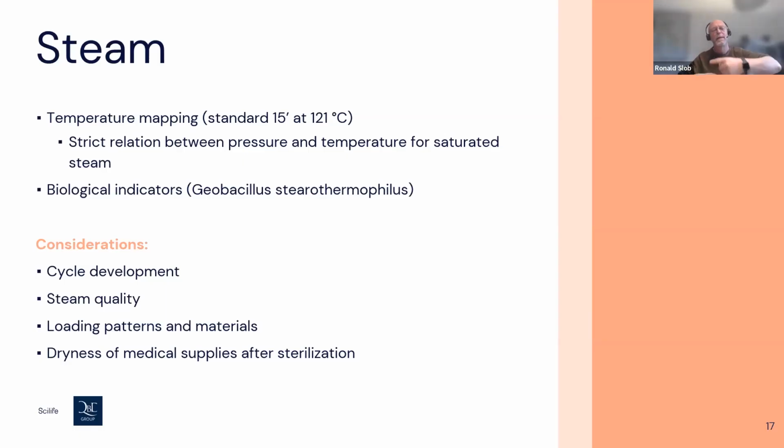I want to go a little bit into depth to give you some examples about the qualification and validation, and what kind of considerations there are. This is not all the considerations I can give, because every sterilization method has its own upsides and downsides, and it's quite elaborate to go into detail for each one. So I just give a high-level assessment that I made for the different sterilization topics.